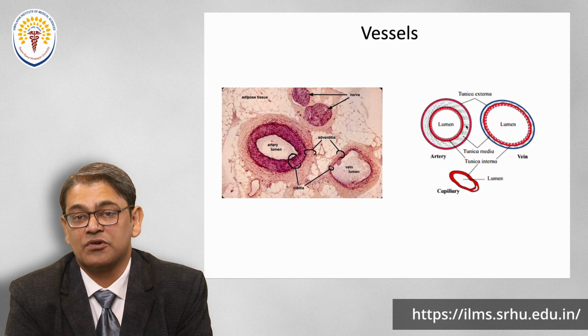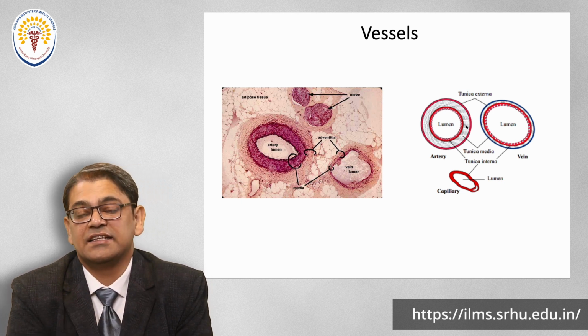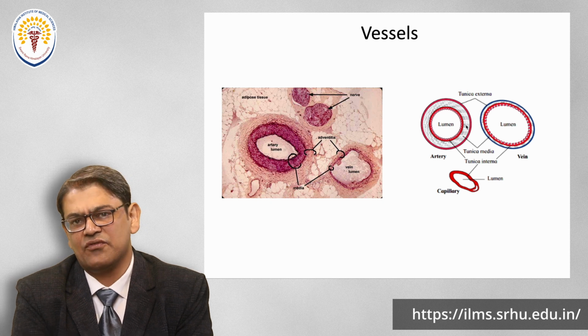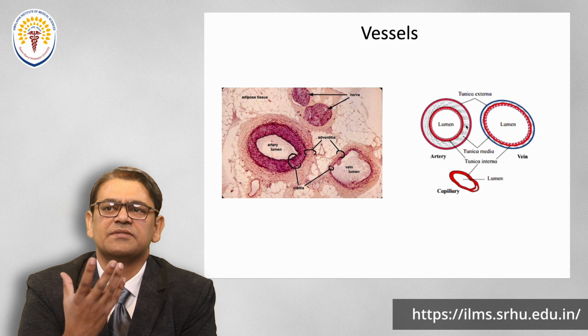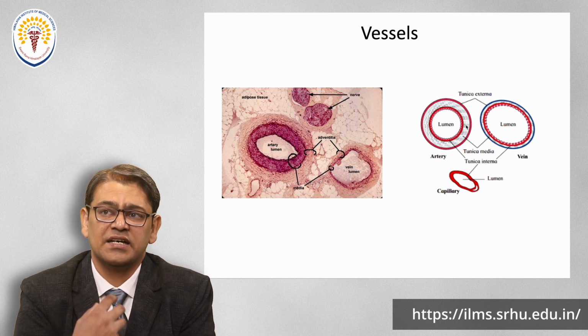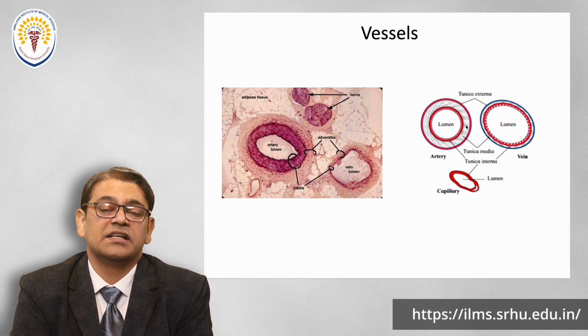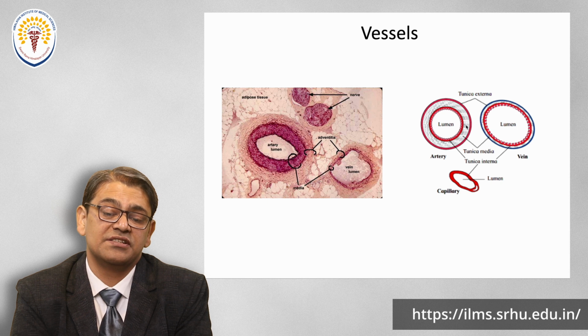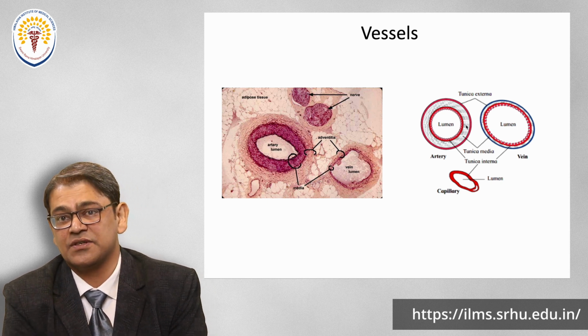Now in the artery, various sorts of elastic fibers are present. They are way more common. The artery closer to the heart is named the elastic artery. Why is it so? Because close to the heart, more recoiling in the structure is required. That's why we have this histology. Always remember the thumb rule: the histology is according to the function, not the function according to the histology.